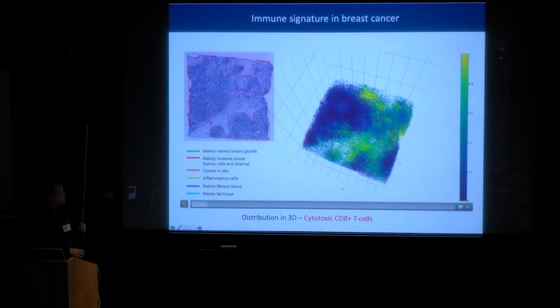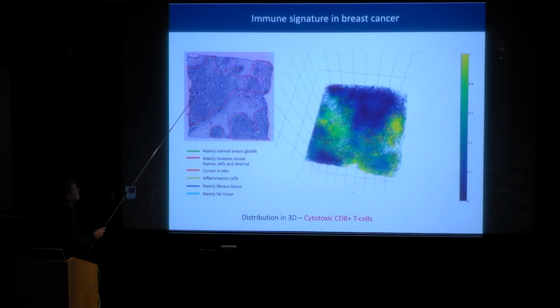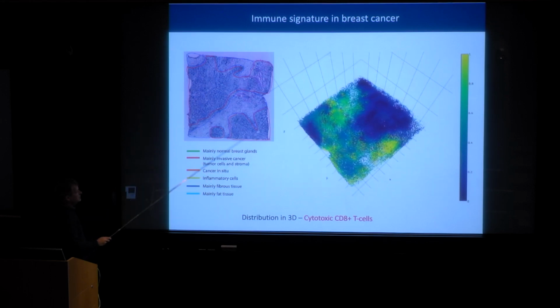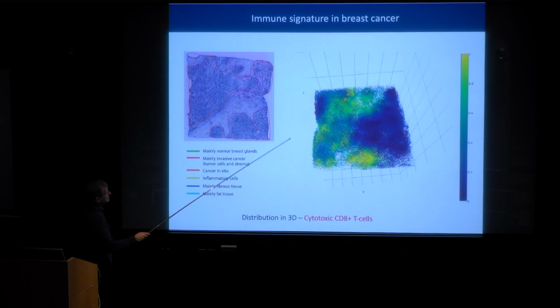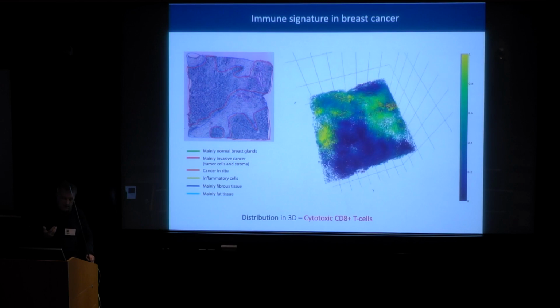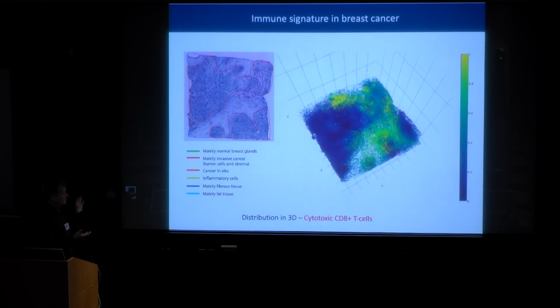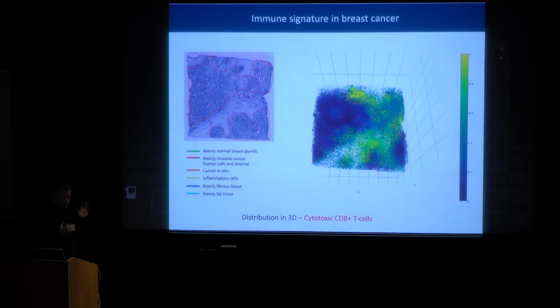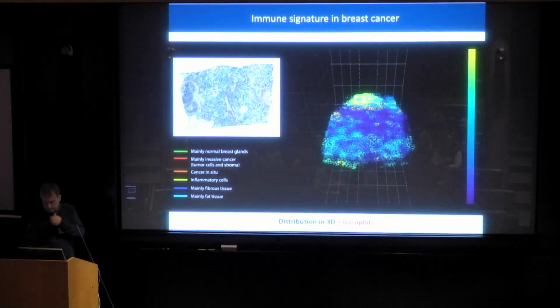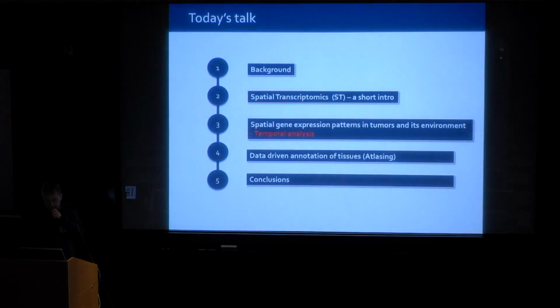So you could actually see, which I think is kind of striking, that this tumor is so-called cold, meaning no infiltration, while this tumor on the other side, coming around the corner here, down here, has infiltration of immune cells, which I think is super interesting because it kind of proves that we have a complex thing with the tumors here in terms of composition of different immune components in terms of the cell. Is that color just CD8? Yes, that's only CD8.